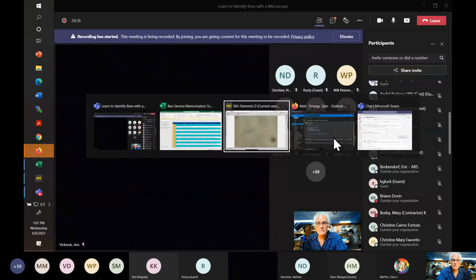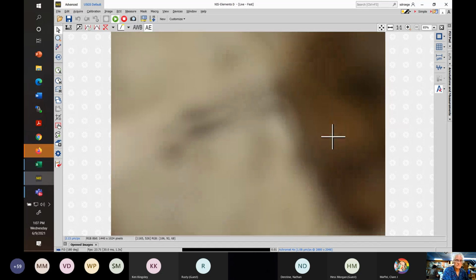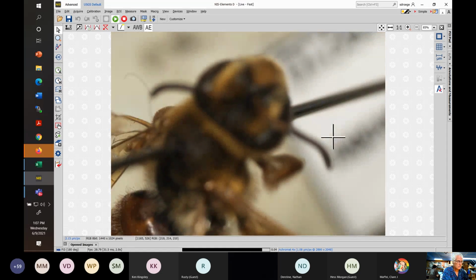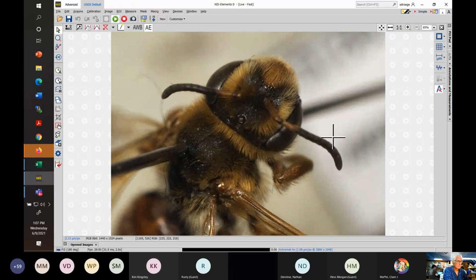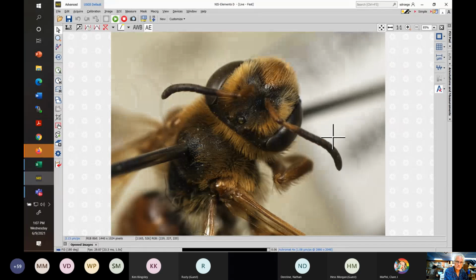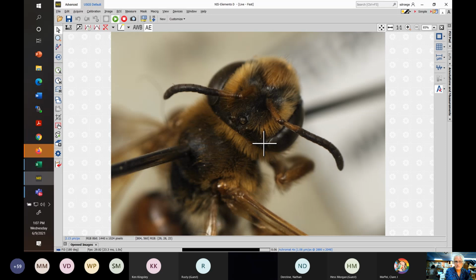All right, so I am going now to the microscope, and I'll show you a couple of female fovea, because again, the fovea seems to be something that many people have a difficult time with. So here is a lovely female Pruinorum from the Dakotas, a relatively common western Rockies area species. And you'll notice that thanks to Clare, we now have a very large crosshairs, and we can actually take pictures, which we'll do in some cases too.